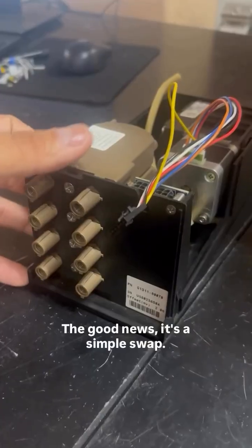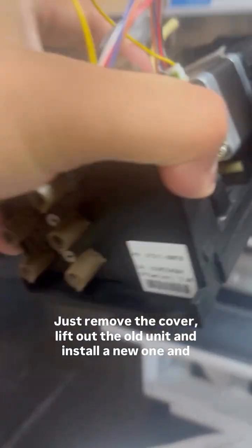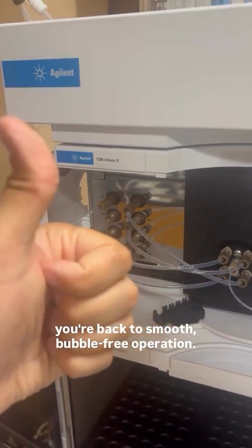The good news — it's a simple swap. Just remove the cover, lift out the old unit, and install a new one, and you're back to smooth, bubble-free operation.